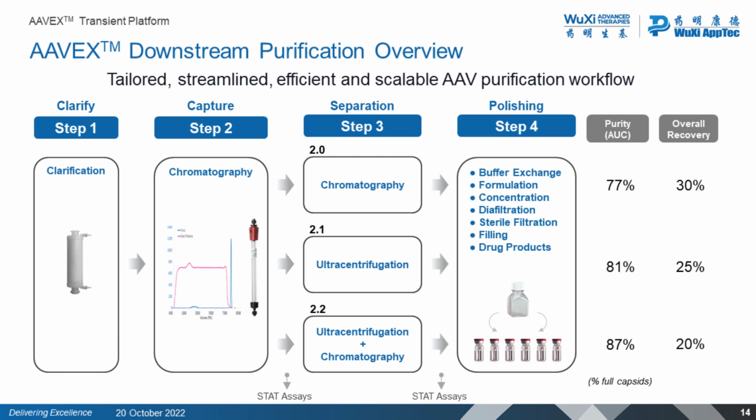In practice, this would need some process development to narrow down the best condition for the gene of interest and the AAV serotype of client's interest. The last polishing step is the final gentle touch to exchange buffer with final formulation, concentrate, sterilization, and to have drug products filled into proper vials and volumes.